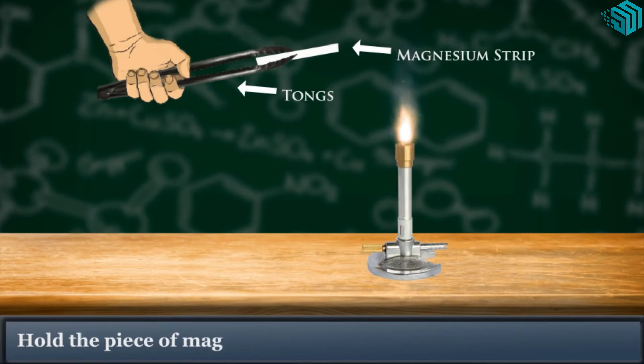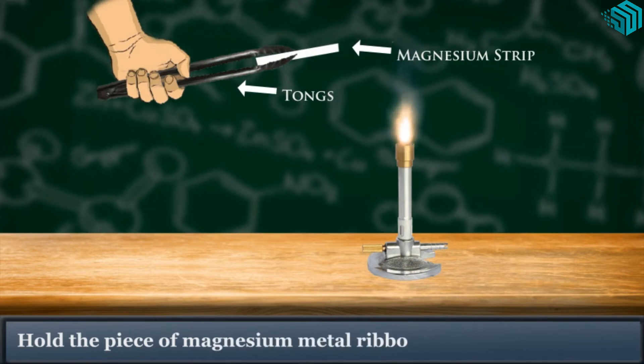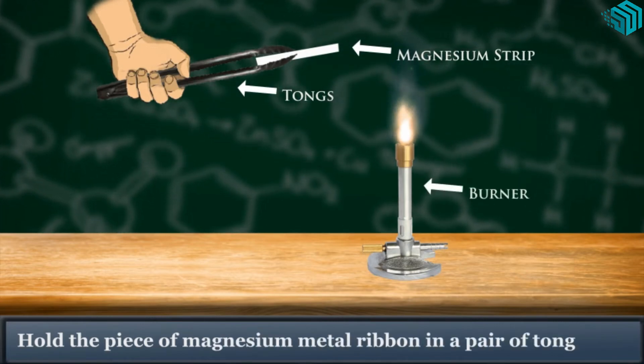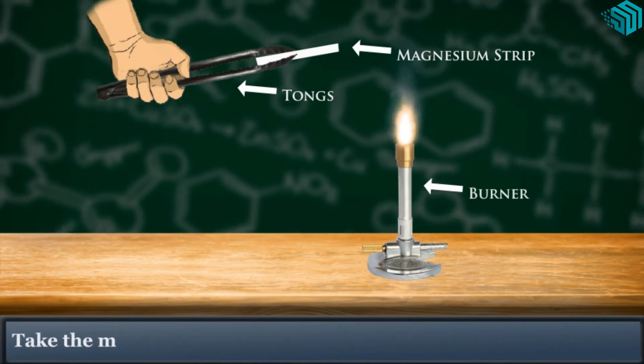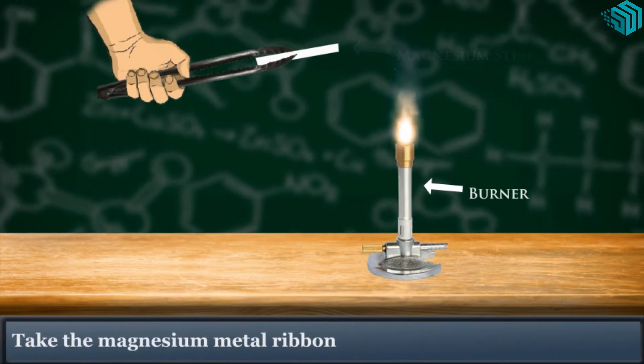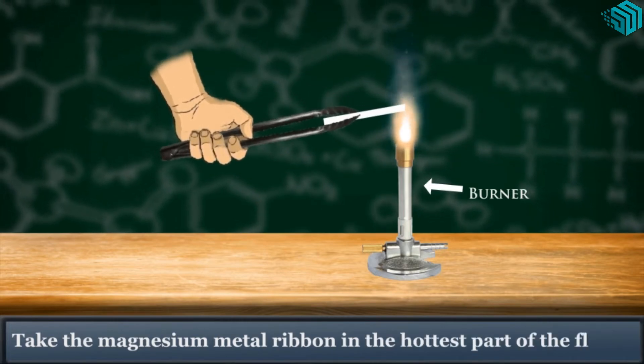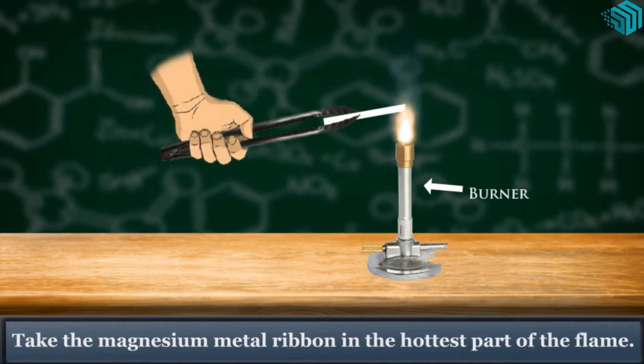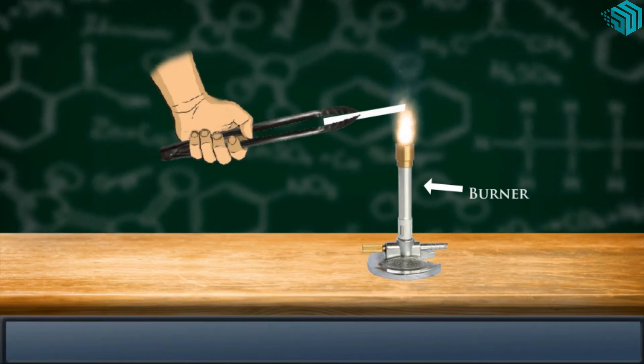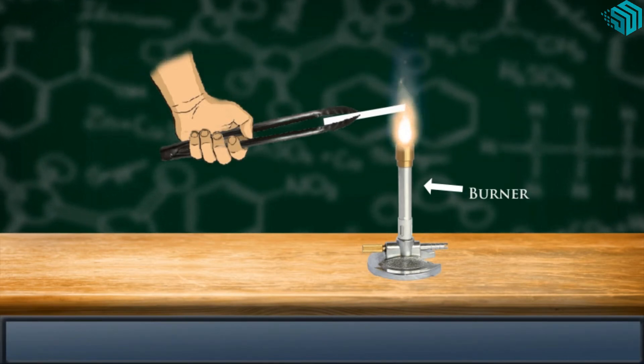Hold the piece of magnesium metal ribbon in a pair of tongs. Take the magnesium metal ribbon in the hottest part of the flame. It will soon catch fire and emit a very bright light.